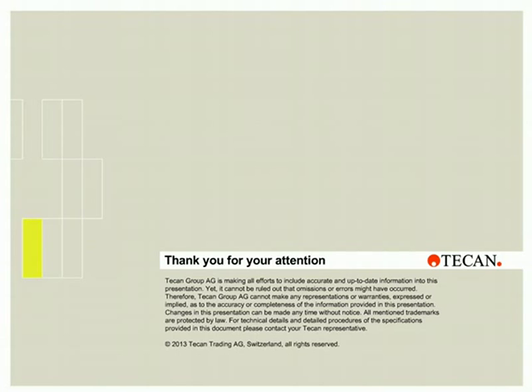Even though I'm not a specialist for programming of the multimode reader, we had very low difficulties to set up the multimode reader in a way that we can clearly discriminate between the GFP signal and the RFP signal, which is in the case of these two different fluorochromes not as difficult because the wavelength of these two are quite far away from each other.